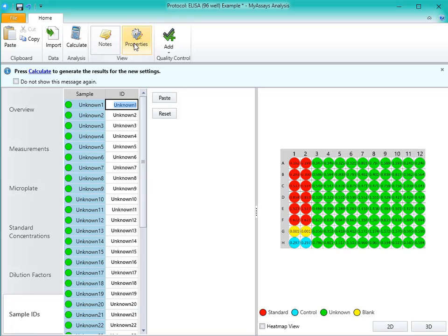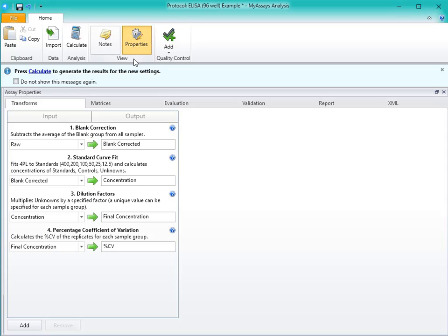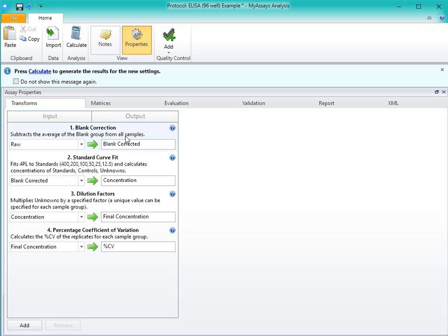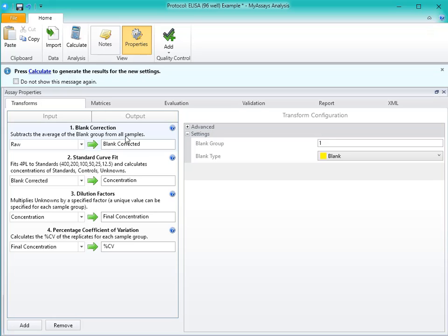Under the Properties tab, we can see the settings used for our data analysis. Under the Transforms tab, we can see the various transforms that perform the data analysis stepwise. First, you'll see a blank correction transform. This will subtract the average value of the blank wells from the rest of the wells on the plate. This transform is formatted to only perform a blank correction if your plate layout contains a blank group.